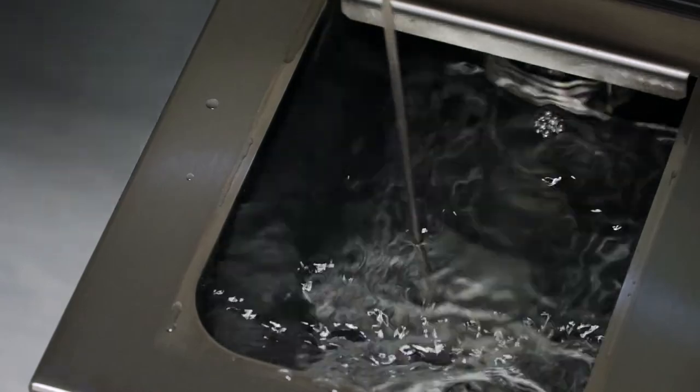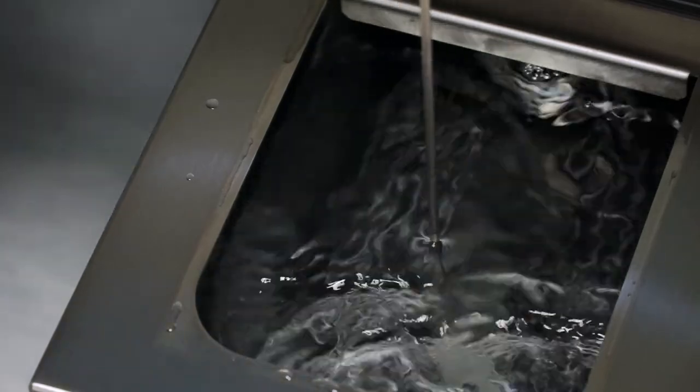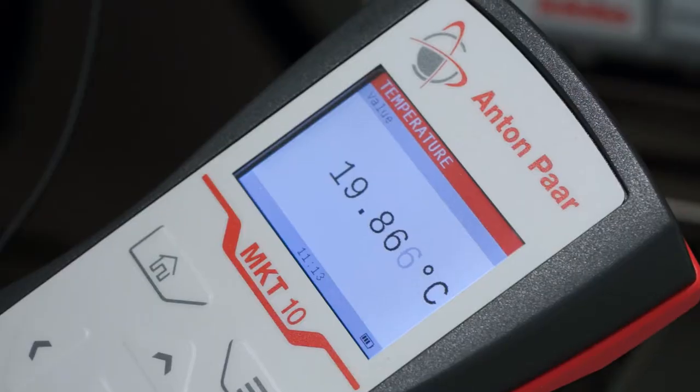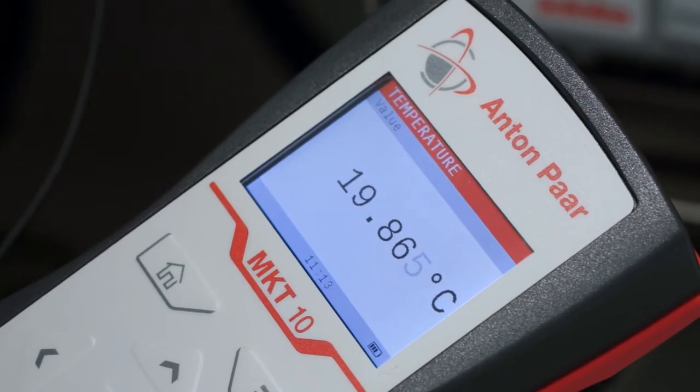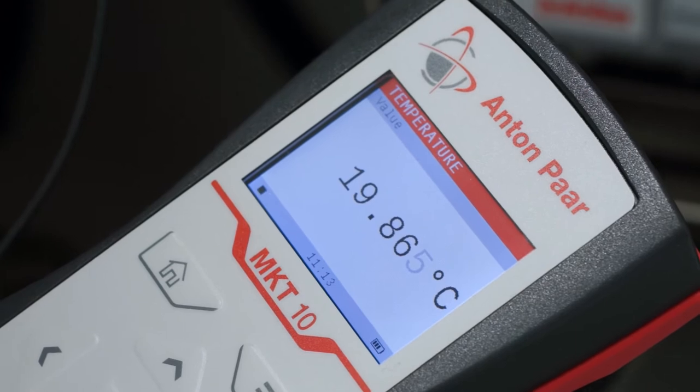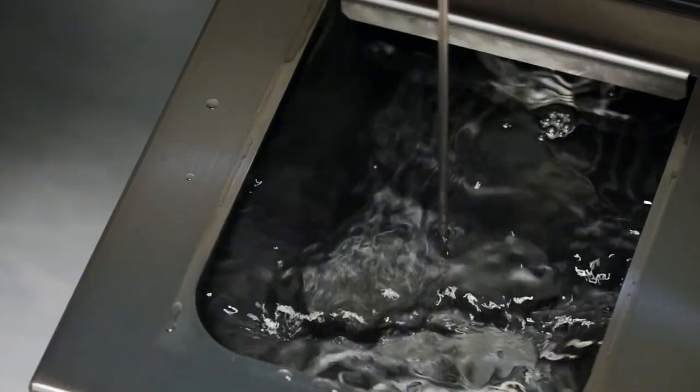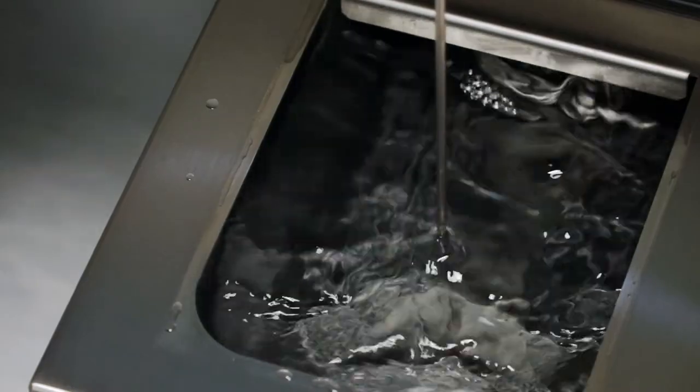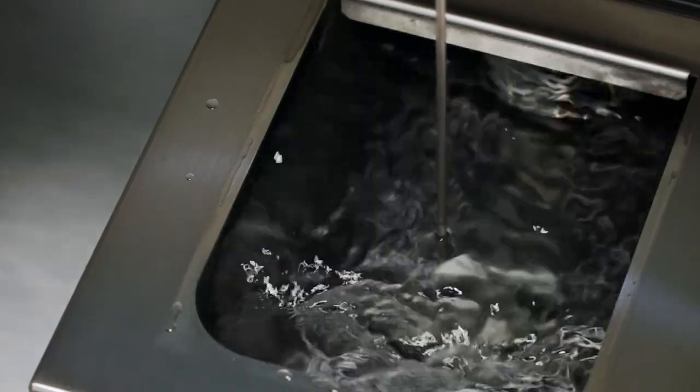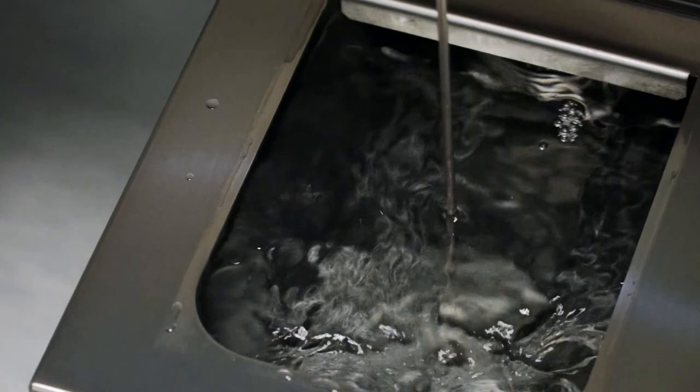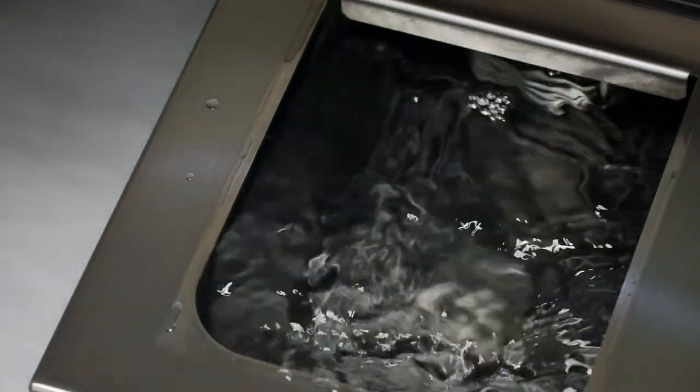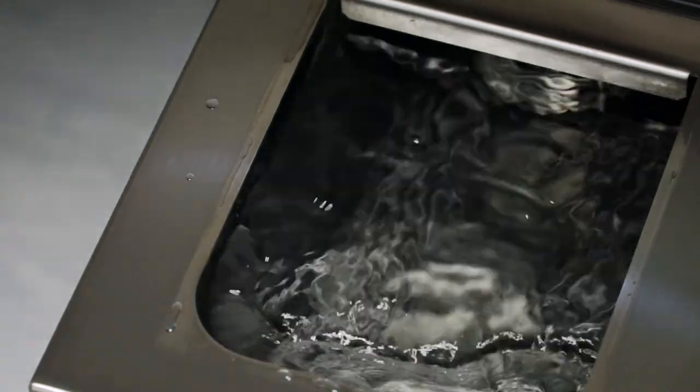Then put it into the liquid. MKT-10 precisely displays the current temperature of the sample. Please be sure to handle the sensor with care. Otherwise, the calibration may shift or the sensor may be destroyed.